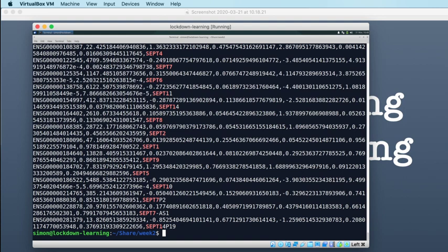The ones we actually want to match, the ones without the P2 and the AS1 and things like that, might have one or more than one number. So if we restrict it just to these ones with just one number, we're going to miss some. So we need to expand this pattern. And so we want things which match sept and then one or more numbers.